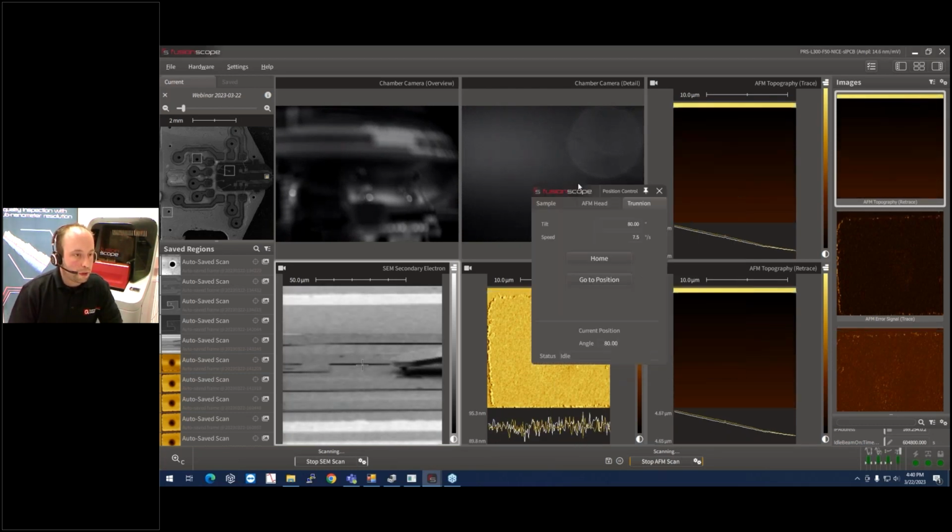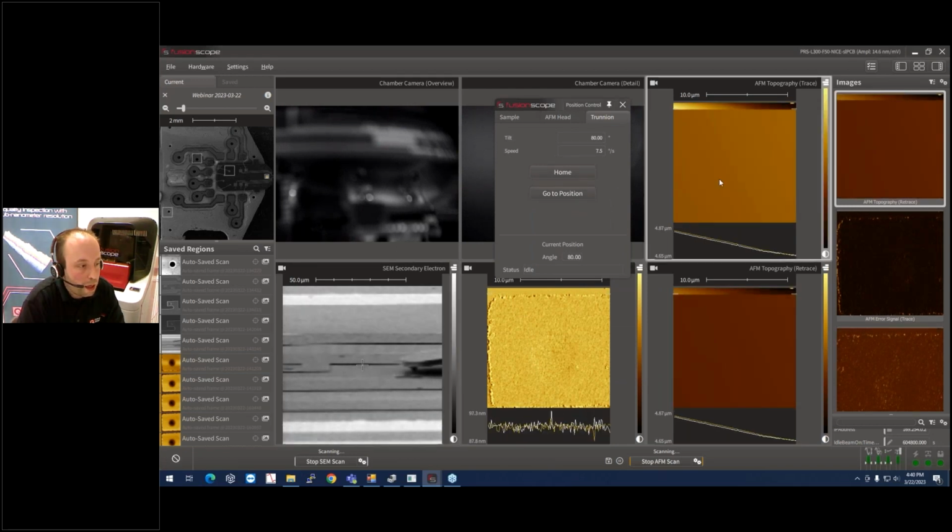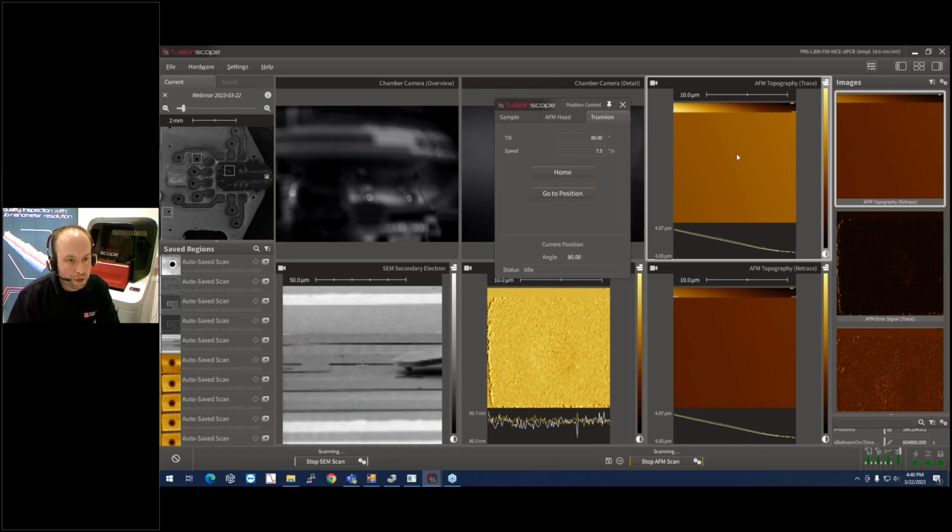And we can look at the topography here and see how it is measured line by line. And we can control this measurement here in the SEM. We have different possibilities for processing this data live.